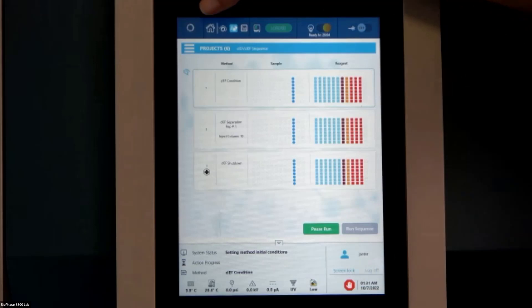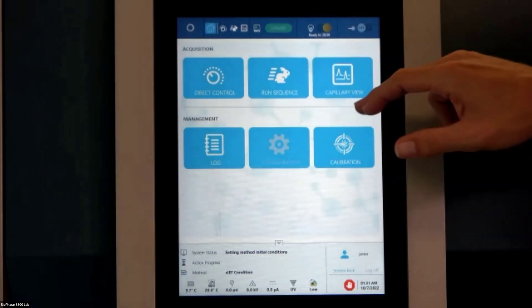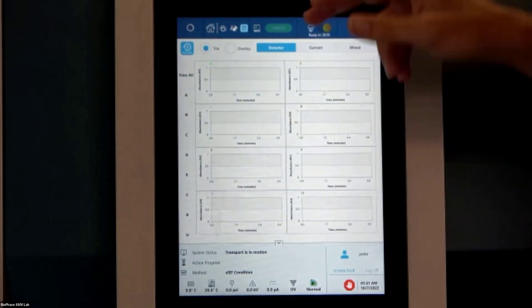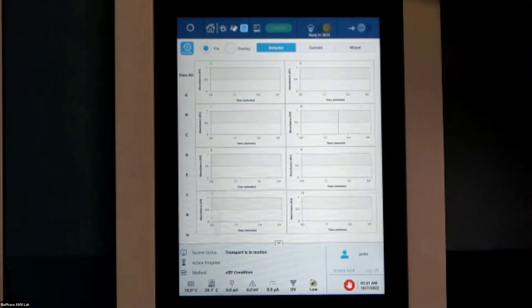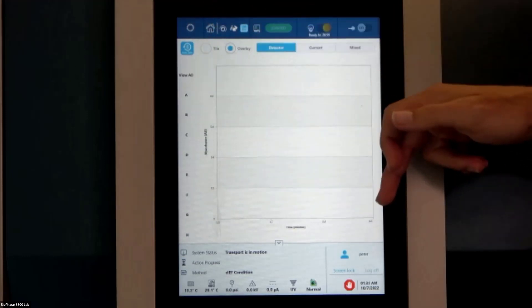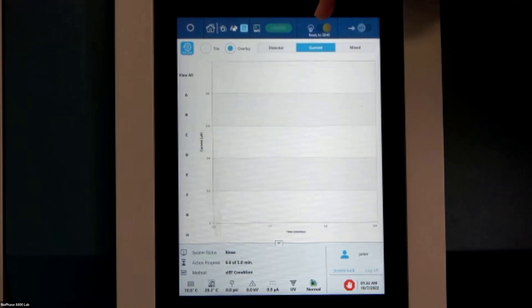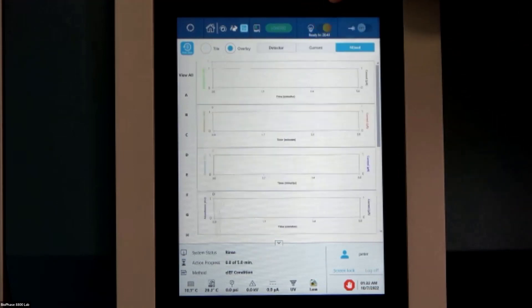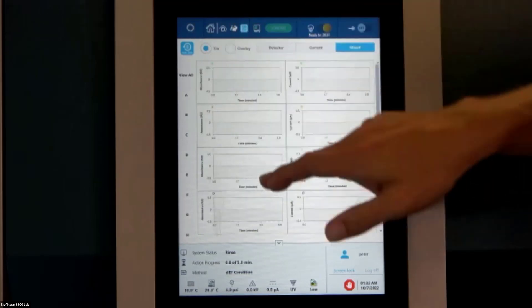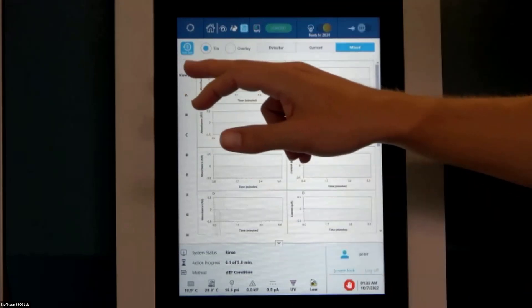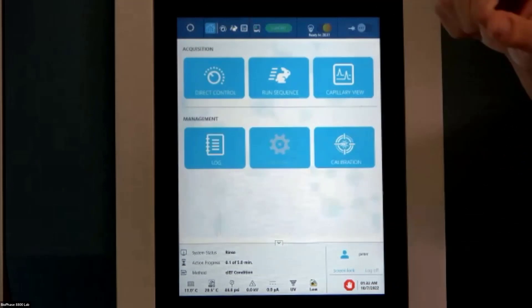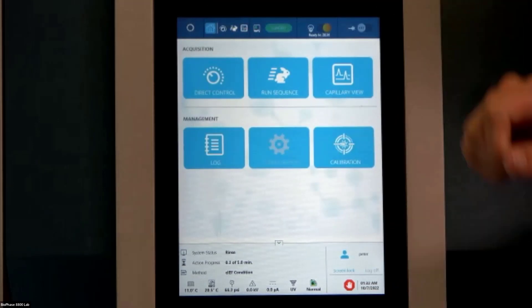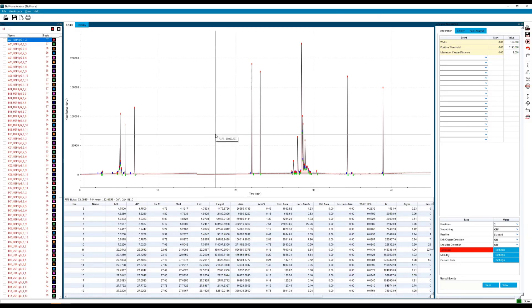Go back to our home panel. That was the run sequence tab there. If we go to the capillary view tab, we can see all eight capillaries and what's going on. Right now, they are tiled, we can go to overlay, we get all eight capillary windows in one overlay. We're currently in the detector view. You can also switch to the current, the generated current or the mix view. And we can tile that up if we want to, or we can look at capillary A, B, C, D, E, F, G, and H. If we so choose, we can go back there. And that is a nice look at our front panel.